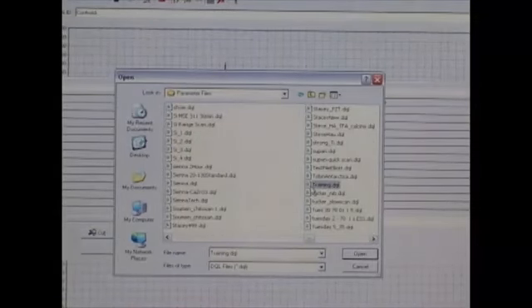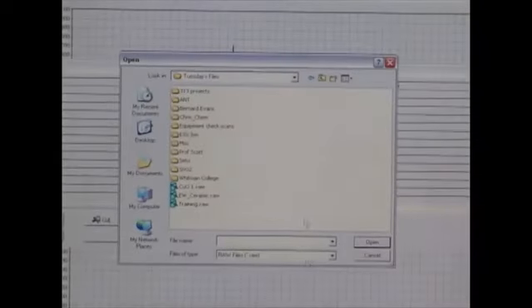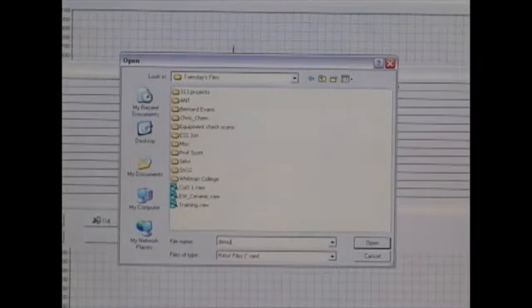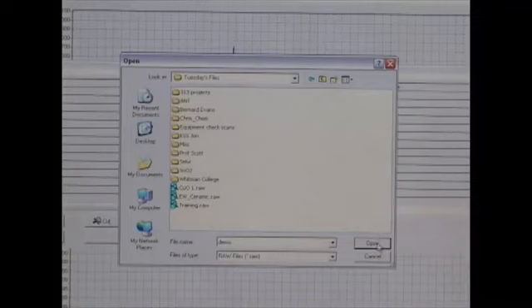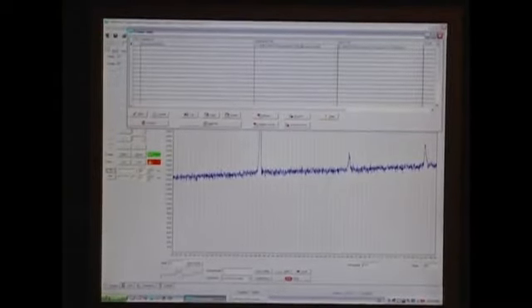I'm going to select my training, and then my raw file, select that. Most people have a folder they've created for themselves, and demo. Now, once I've done that, everything is loaded and ready to go. My sample is in the chamber.